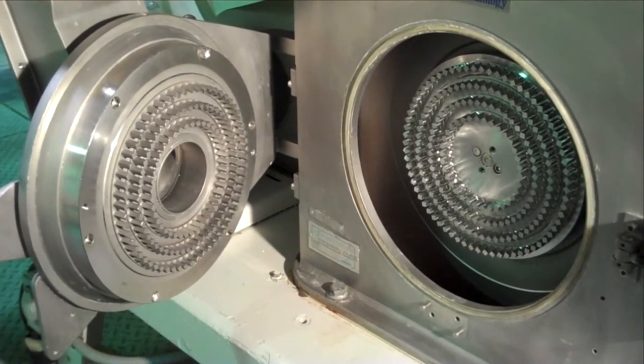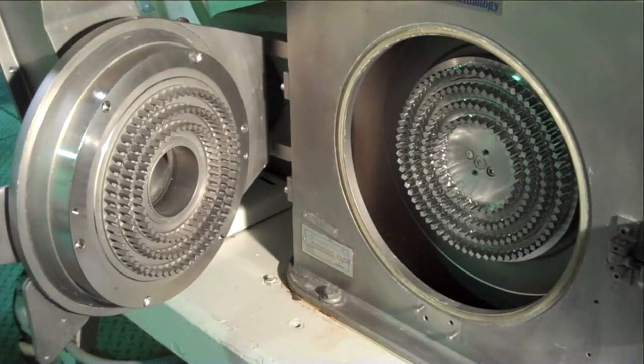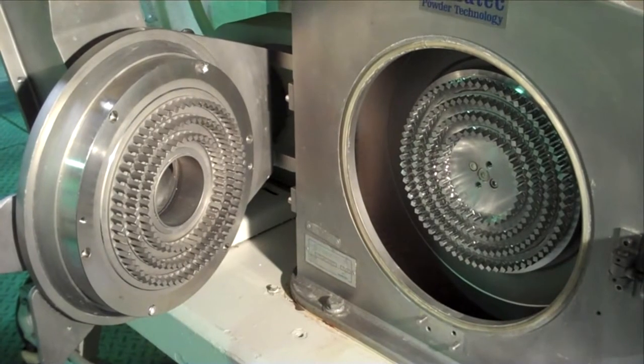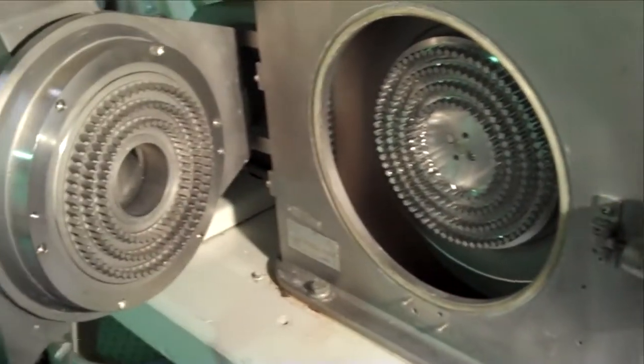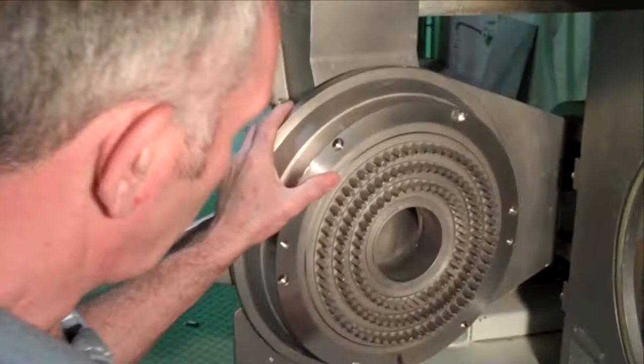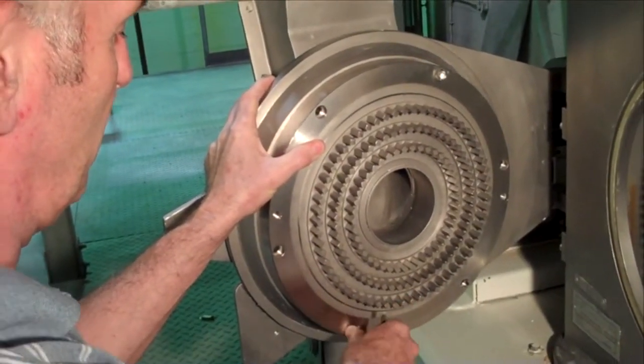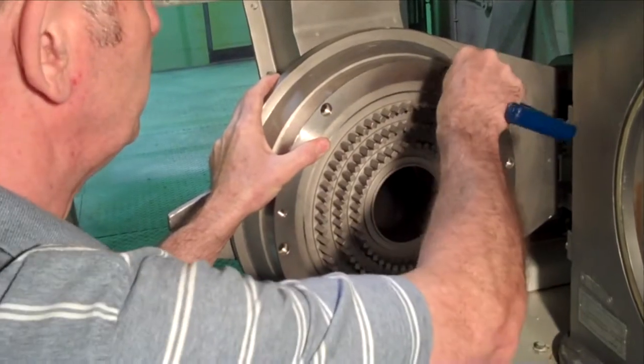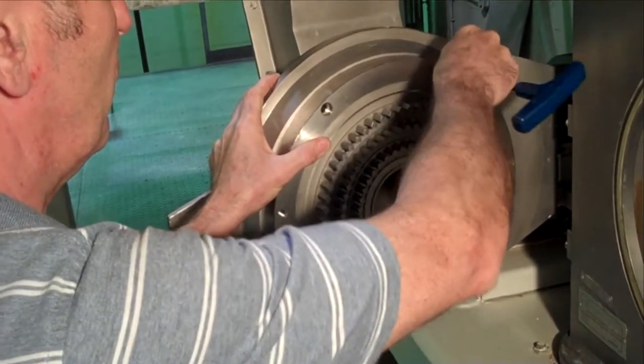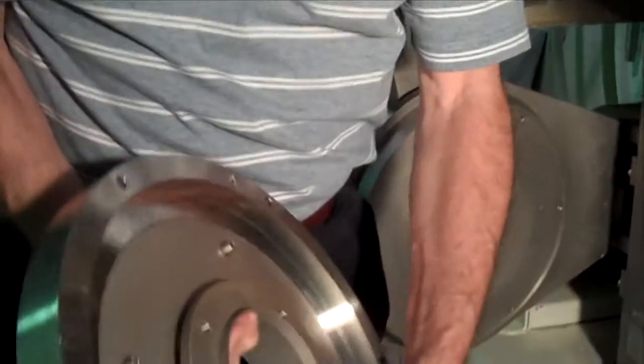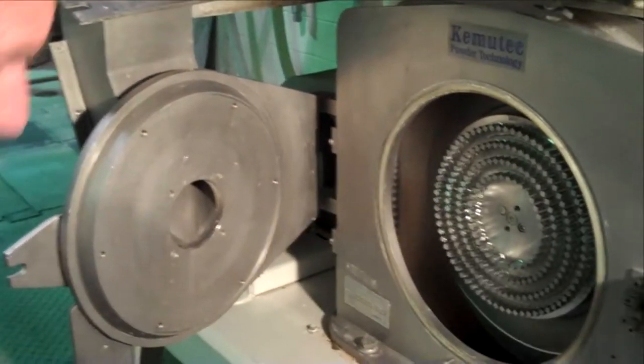Removal of the grinding media to either clean, perform maintenance, or change to an alternative type is simply a case of removing the stator from the door by taking out the screws, pulling that off, and then removing the rotor from the main drive.